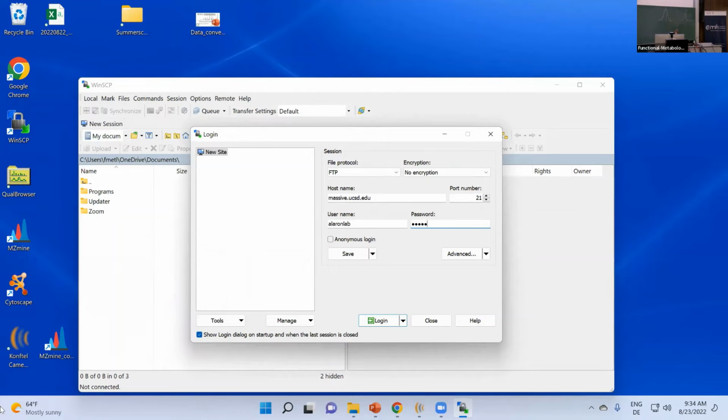Let's see. You want to help me with this real quick? I want to make sure I'm doing it right. If not, I can just log in. Yeah, maybe just log in on yours. Sorry, technical difficulties.